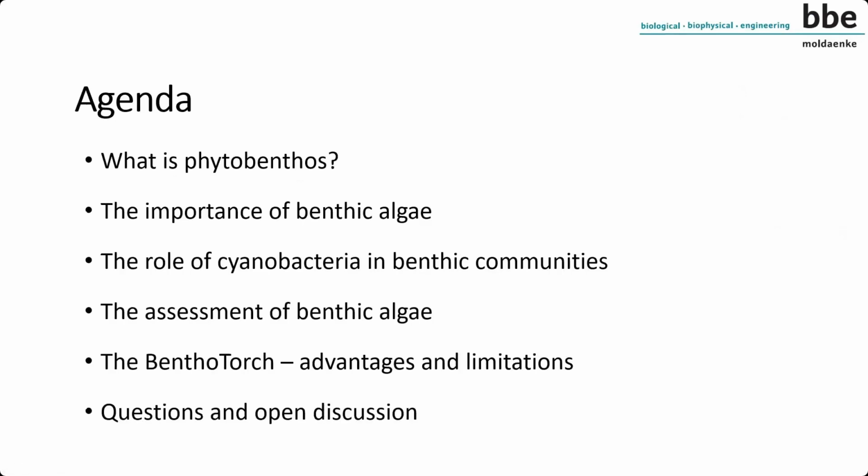First, what is Phytobenthos? And in this case, also the importance of this benthic algae, especially something which we have to deal with much more in the future, is the role of cyanobacteria in the benthic communities. And of course, it's now very important to see how we can assess the benthic algae, what kind of method, techniques we have.